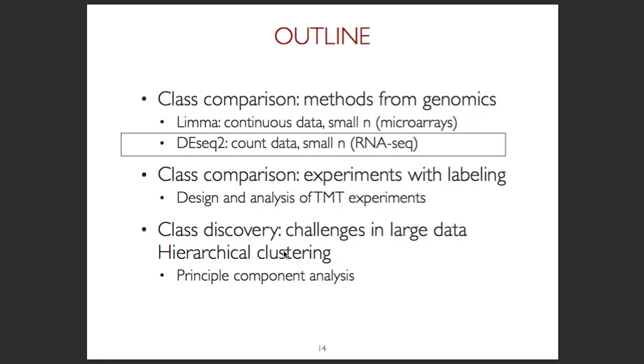And it turned out that when we work with count data, the properties of the data are quite different than when we work with intensities. In particular, the assumptions of normal distributions are not verified. And what happened in the transcriptomic community is that researchers tried to build on things such as LIMMA and other things to now work with count data. And what I see now is two things. One is we do have count data as well in mass spectrometry when we work with counting MS/MS spectra. And in this case, sometimes people don't work with the data as they should with counts, but they use something like a t-test or something else. I would like to comment on the fact that if our data are counts, they should be analyzed as counts.